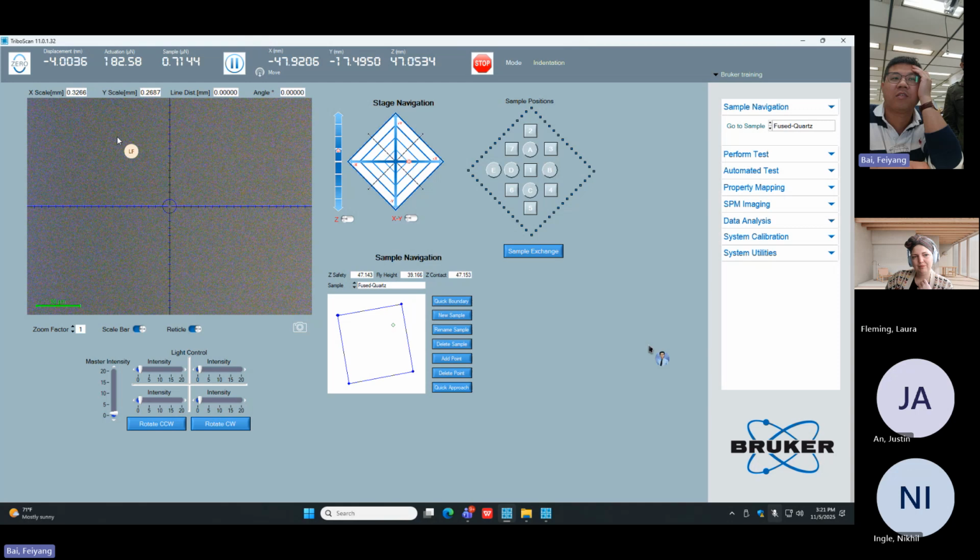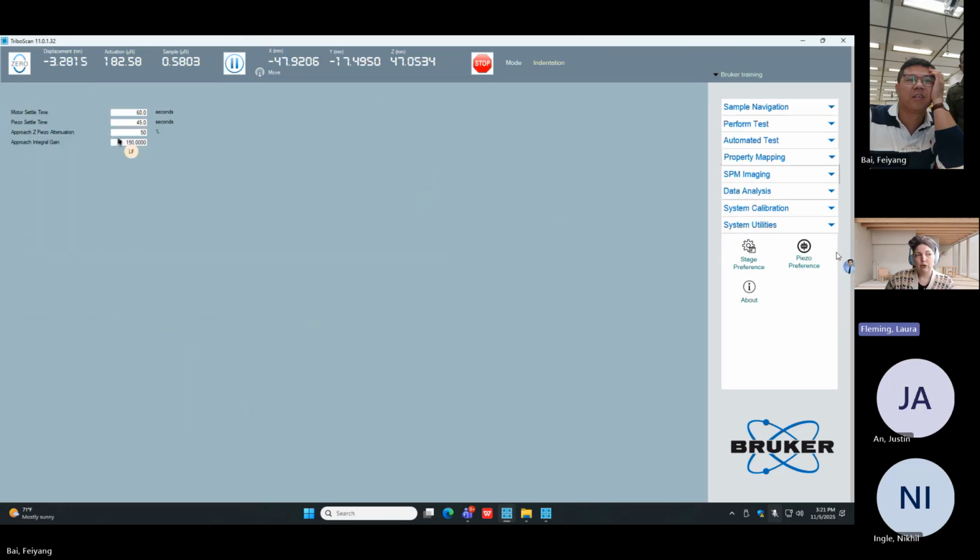Of course, I'm sorry that you didn't get a chance to play with this interesting material. I know it's all fused quartz and polycarbonate. I mean, my job is to get you guys set up in the world such that you can go have a great time on my instrument, know that it's working right, know that you're getting good results, and then go and try a bunch of weird stuff on weird samples. It's just usually I'm off site before that second part happens. But yeah, we're always happy to work with you and provide whatever recommendations and instructions that we can. So let me get some people involved who have done some more interesting things and see if we can at least help you think about how to test it better. Okay.